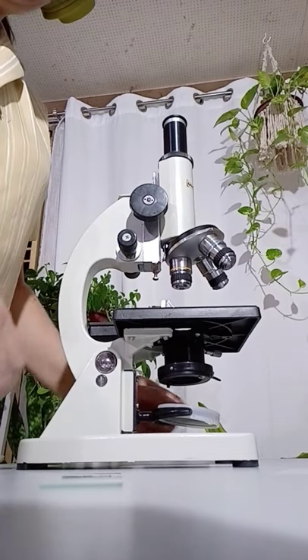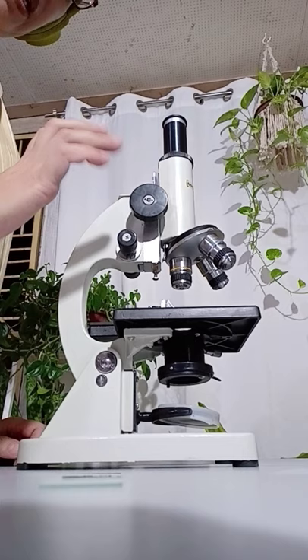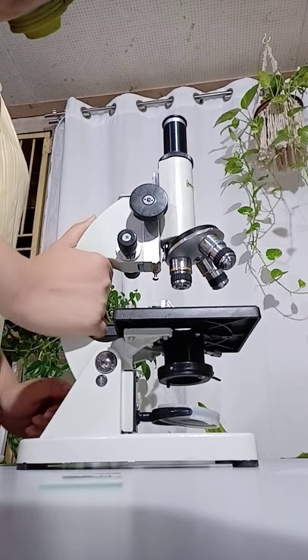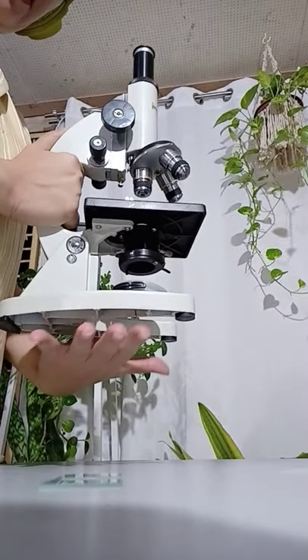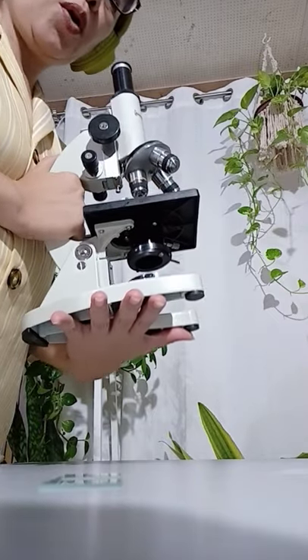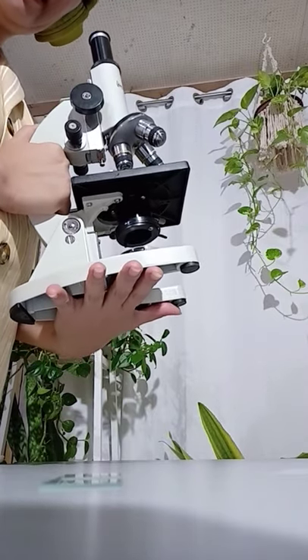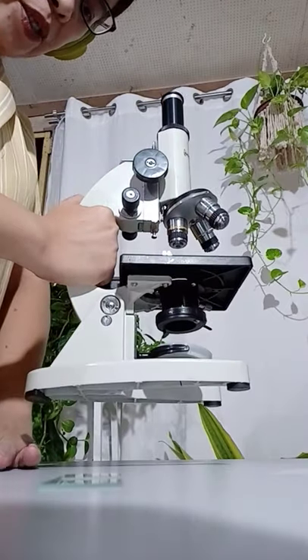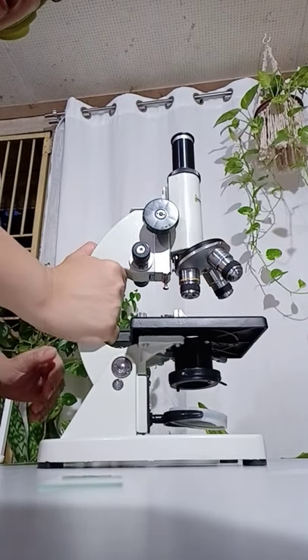If you are left-handed, do otherwise. Get hold of the arm of the microscope with your left hand and support the base with your right hand, carrying the microscope uprightly — not swinging it on your side like a handbag. And place the microscope about a palm's width away from the edge of the table very gently.